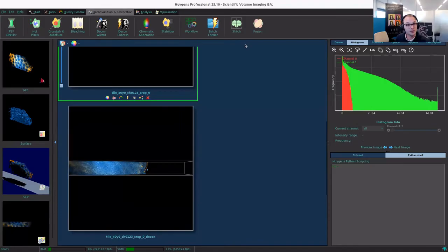So we have now first implemented a pyramid file structure as part of our stitching module. That enables you to stitch and deconvolve images that do not fit in your RAM. We still recommend that one tile can be deconvolved and fits in your RAM. Deconvolution needs a little bit of juice, but your whole image no longer needs to fit in RAM. So it reduces the amount of RAM you need to deconvolve an image. Thereby, you can handle bigger data with the images that you have.